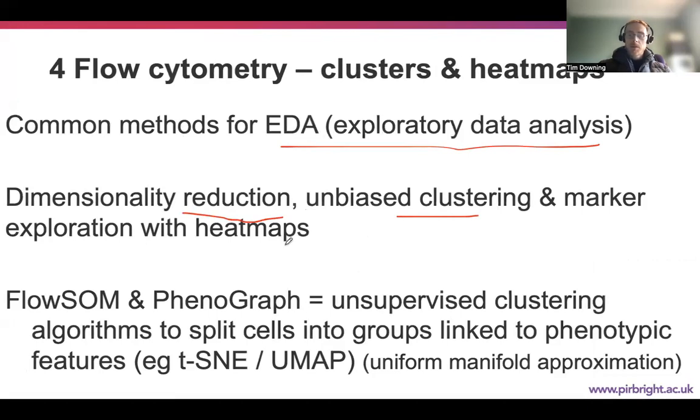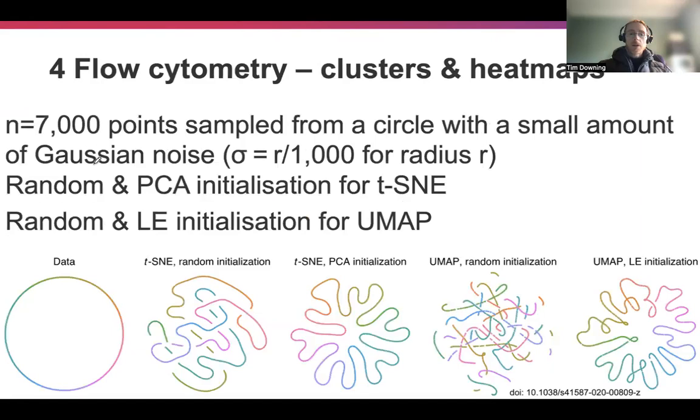and other plotting functions. As you know, there are certain packages like FlowSOM and PhenoGraph that do unsupervised clustering to split the cells into groups. One consideration is that with t-SNE and UMAP, it's garbage in, garbage out, and if you have data of a particular shape, they may not necessarily resolve it in an appropriate manner. Other methods like PCA or MDS may be more reliable or more easily interpretable by people, whereas UMAP and t-SNE sometimes lead to misinterpretation.